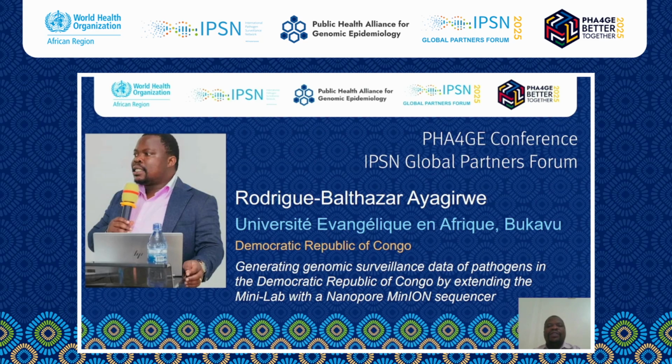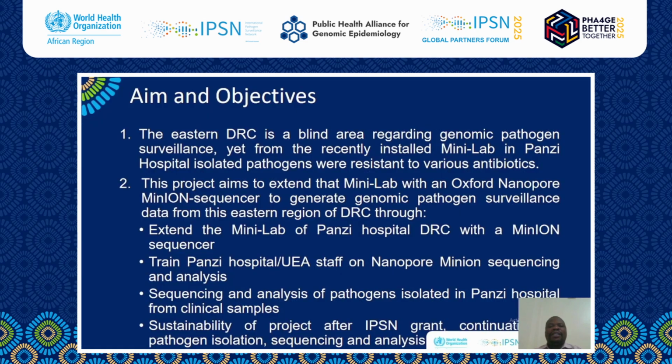So it is a pleasure to introduce to you our project on generating genomic surveillance data of pathogens in the DR Congo by extending the mini lab with a nanopore MinION-sequencer. The DRC was considered a blind area regarding genomic pathogen surveillance, and yet from the early initiated mini lab in Panzi Hospital, we have been able to isolate various pathogens reported to be resistant to antibiotics.